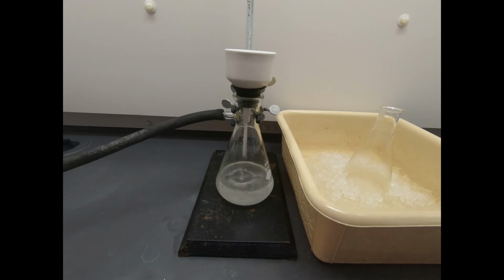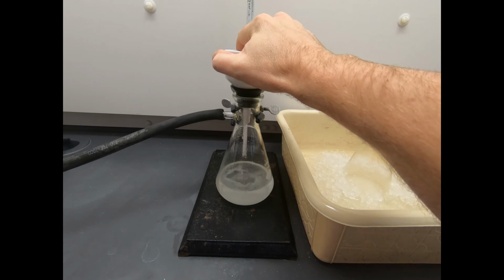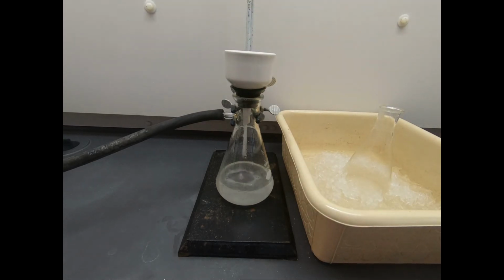Okay, this is going to take a little bit of time, though it's running completely as we'd expect. Filtrations get slow. Now, if you find things that are really slow, let's say we're going to run this experiment again. You might say, wow, that filtration got kind of slow at the end. So maybe the answer is, for this amount of material, I'd be better off choosing a larger Buchner funnel. And that would give a larger surface area in the filter plate. And so we get less resistance from the solid, and the rate of filtration might be quicker.